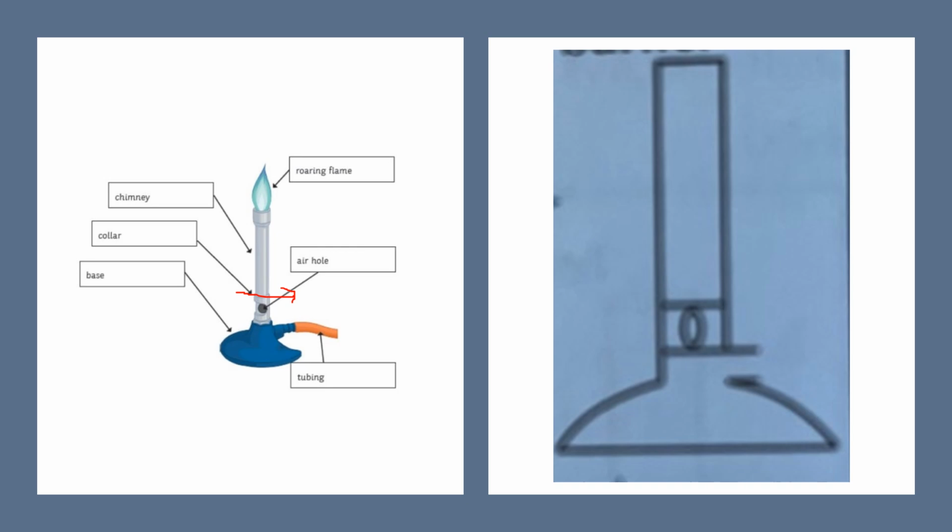Be very careful. You need to be very safe in the laboratory. You can check that with more oxygenated air, more air, the flame is a blue color. Try to cover the air hole and you can see it will turn to a yellow color. Okay, do all the adjustments in a very safe manner.